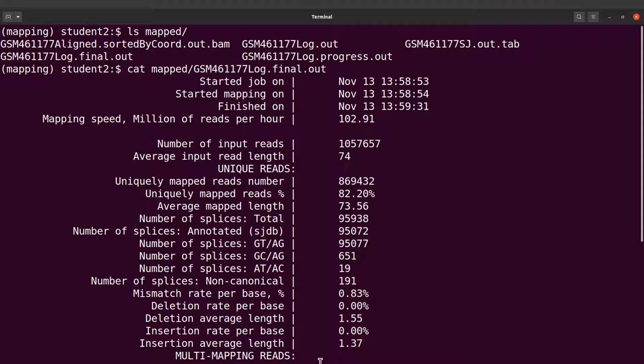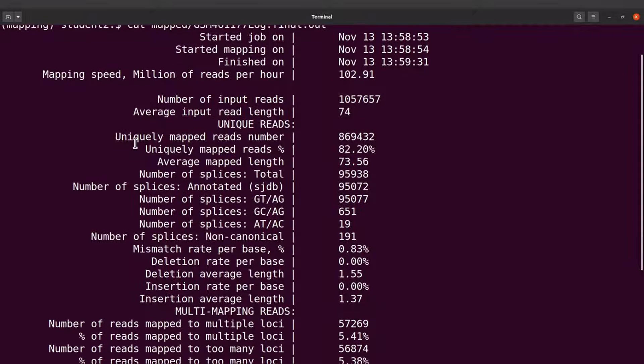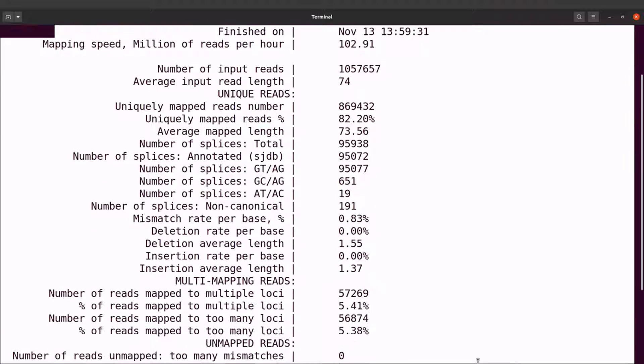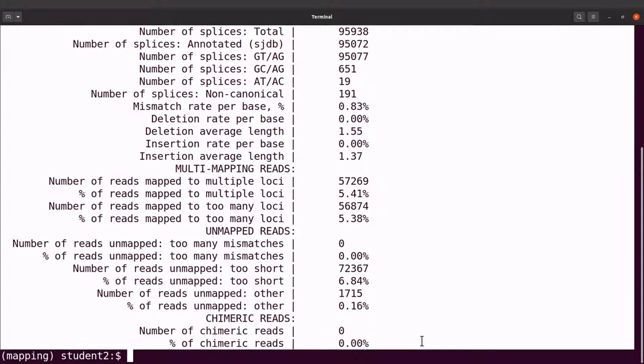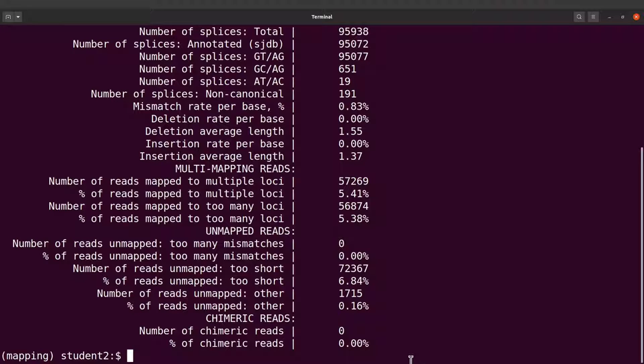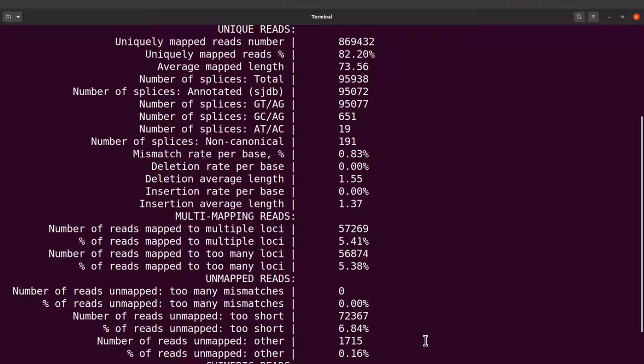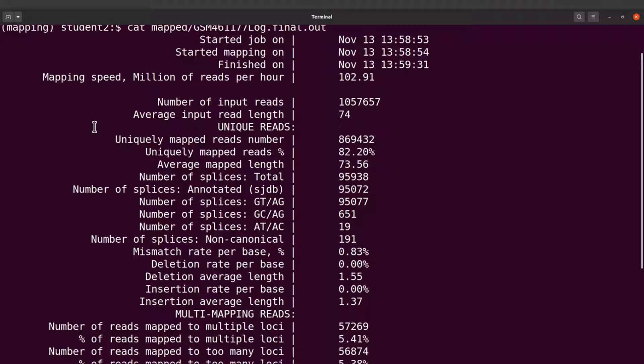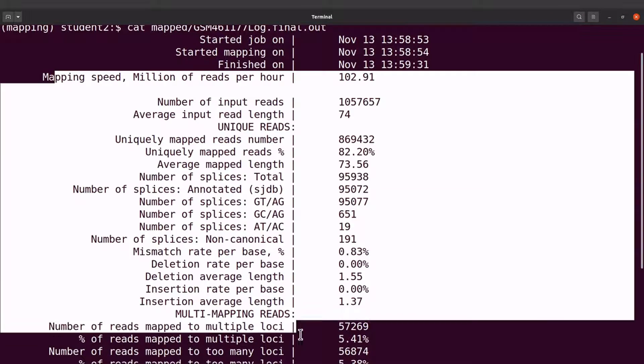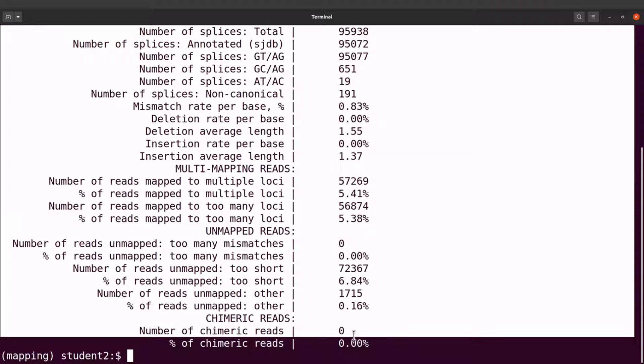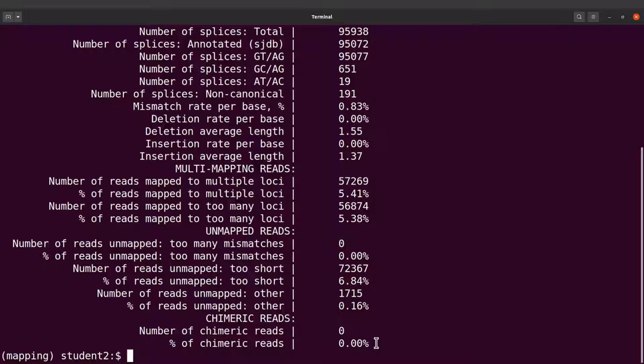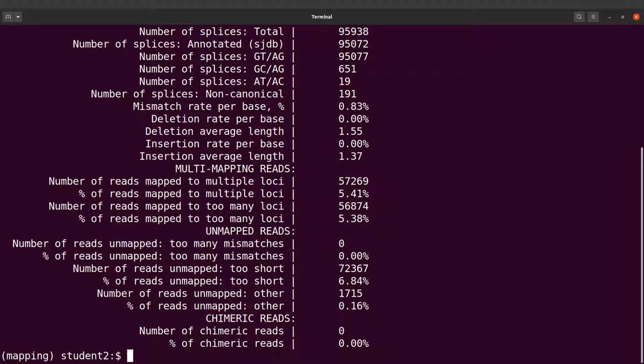We can also visualize this mapping statistics report here. So what we are going to do next is to run MultiQC and then use that to aggregate everything here and then generate a plot file so we can do that and then view the plot. So let's do that.